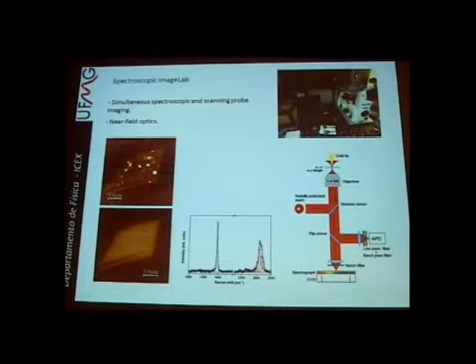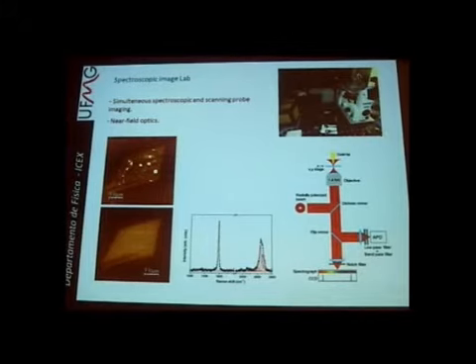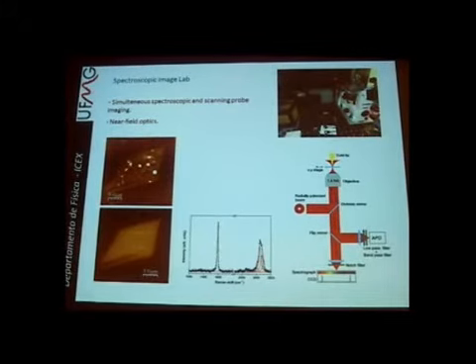This is another line of research with Raman we are doing here, the spectroscopic image lab. Here is an inverted microscope. We have a scan head. We have the spectrometer here, and basically the light comes from the bottom, and the sample is sitting on a transparent substrate, and we illuminate this sample from the bottom. We can place a tip on the top, and the light is scattered back. We can do experiments like this, with a scanning probe and Raman simultaneously.